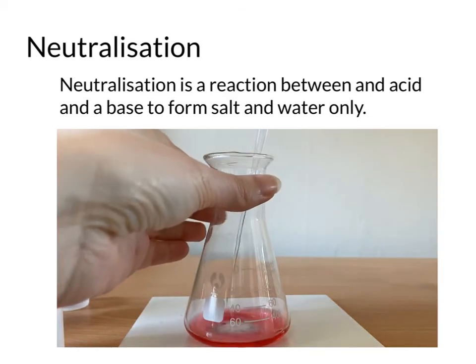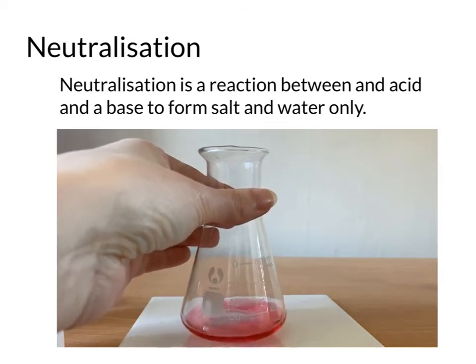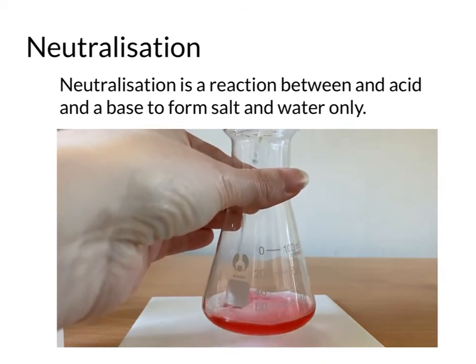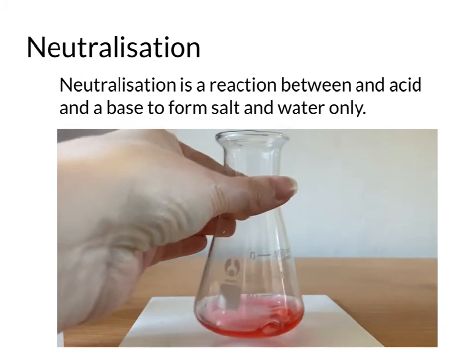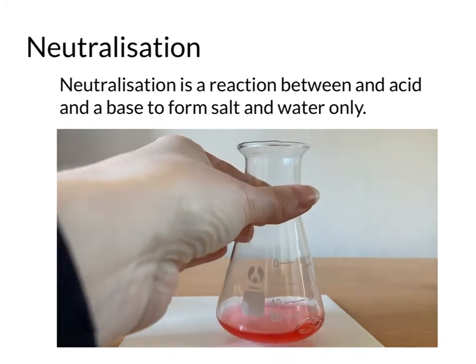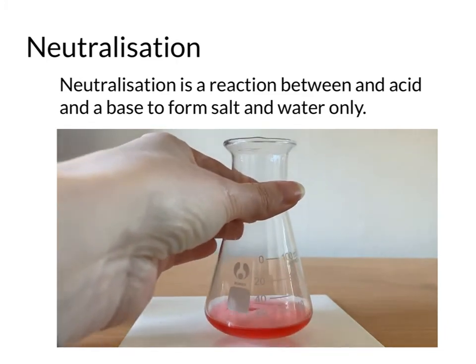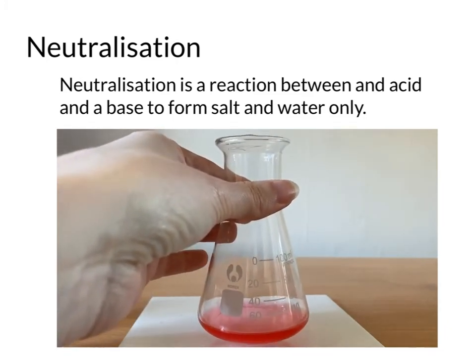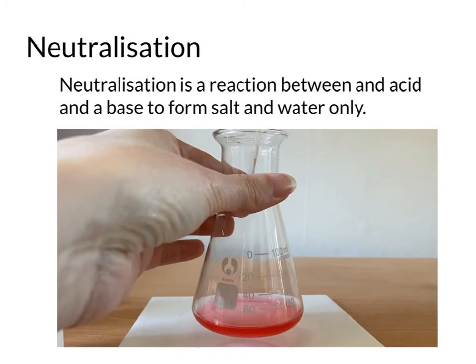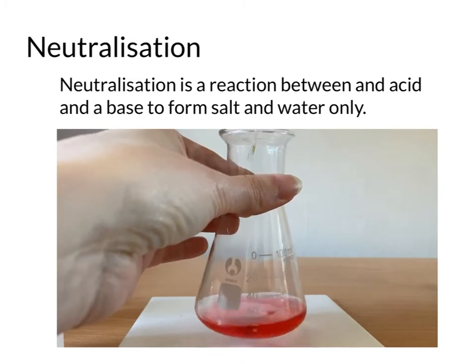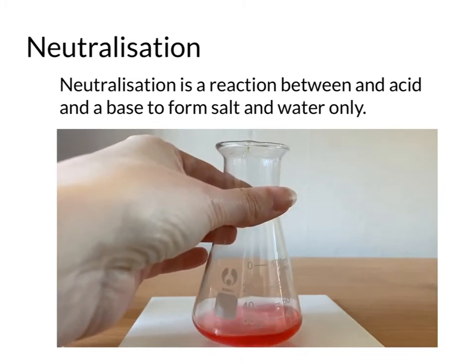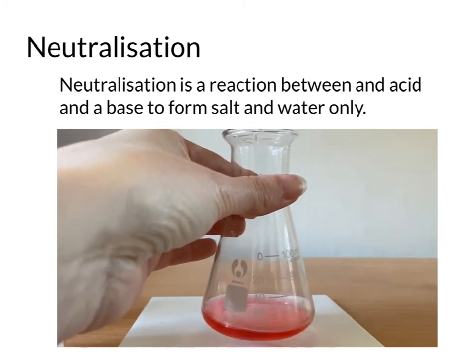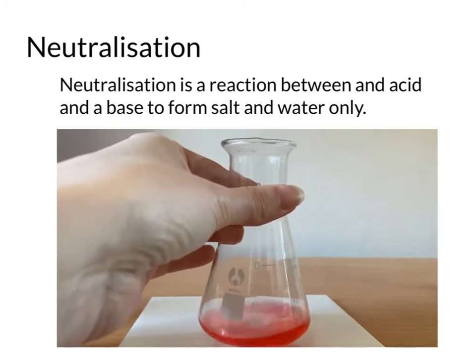This is a video of a neutralisation reaction that I'm doing. I'm using a universal indicator to show that I've got acid — hydrochloric acid in this case — in the conical flask, and then I'm adding alkali, sodium hydroxide, a little bit at a time.